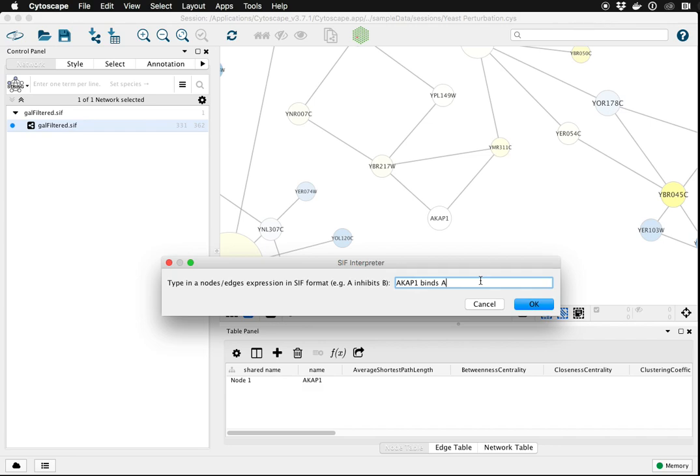So I'm going to connect ACAP1 to a new node A, B, C, and D—to four new nodes with this one typed-in command.